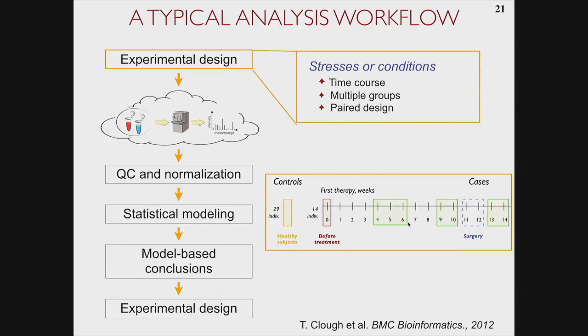At which time point do they become changing? So there are all kinds of questions you can answer with this design, and you cannot really do it with a pairwise t-test. You really need to model all the data jointly, and that's exactly what MS-STATS is doing.